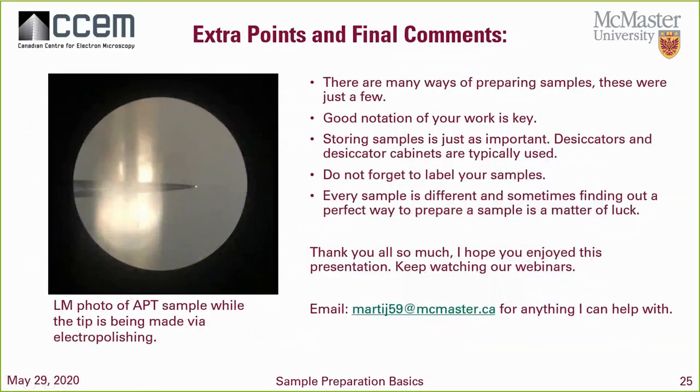A couple of extra points to finish up this webinar. There are so many other ways to prepare samples. These were just a few. Make sure you keep track of your work. After you learn a new way of preparing a sample, practice and keep good notation of that process, of that work. Because a big thing that I found is sometimes you can come up with your own tips and your own ideas, and next thing you know, you have your own tips to share, like I shared with you today.